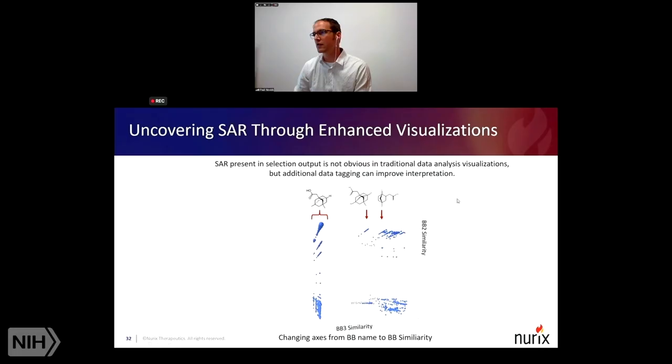So certainly here's the plane that we identified previously with that sort of aldo-like warhead. But then I can immediately see, all right, these are the features that are pretty much kind of analogs of this initial plane of features. These are all sort of analogs of this more aldo-like building block.